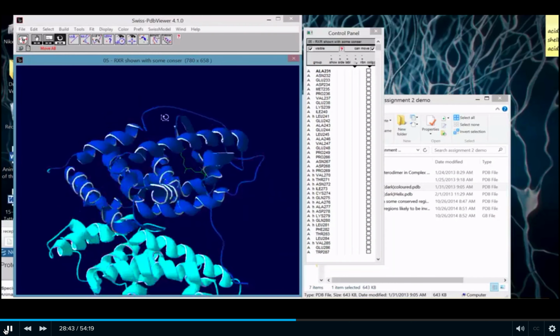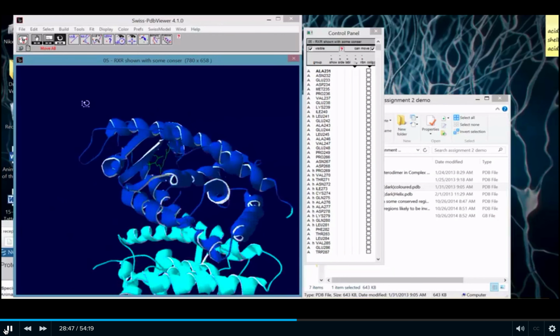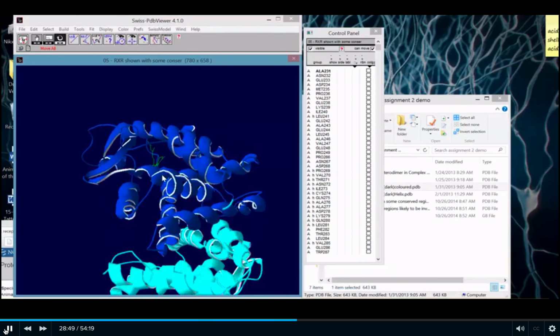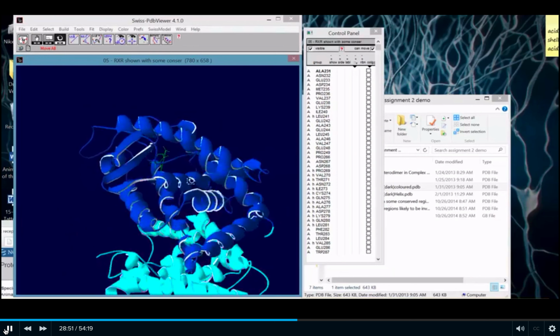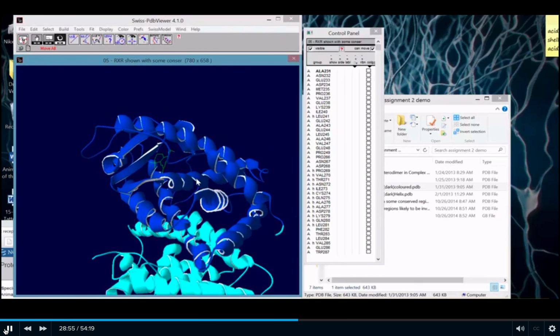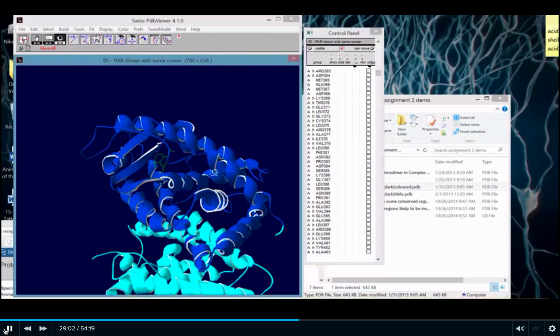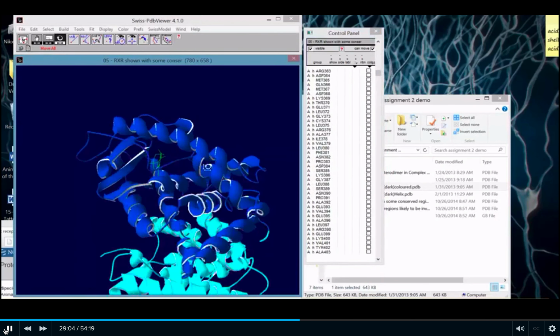Well, really crudely, I could start to change the overall structure. If I look at this protein, here was the helix I was playing with before. This helix is kind of sideways. Now it's going into the plane of the monitor. I could change this in such a way that it might allow me to skew that helix to the left or the right.